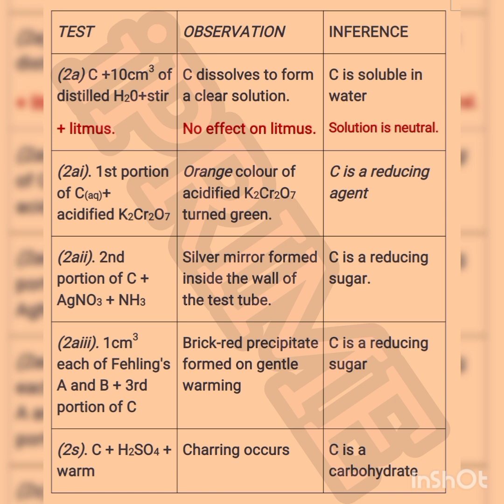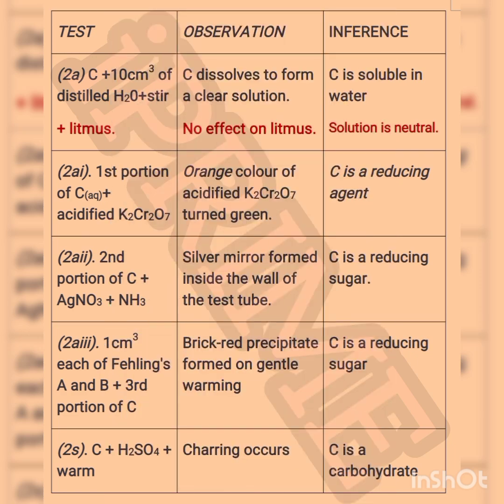Then under our observation, no effect on litmus. You can see it doesn't have any effect on litmus. Then under inference, C forms a neutral solution. You can see what I've recorded there.